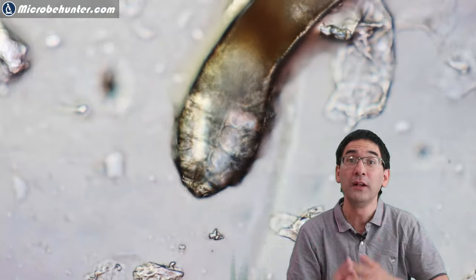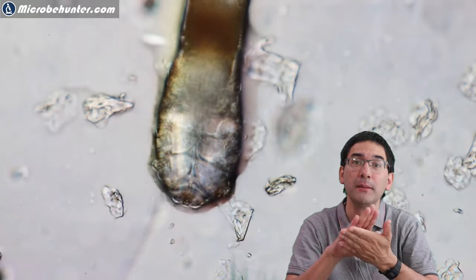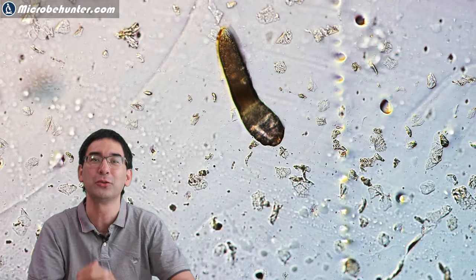Now why do they move? They move because of my sweat — the tape was moist, and the moisture dissolved the glue of the tape a little bit, allowing the face mites to move and crawl along.